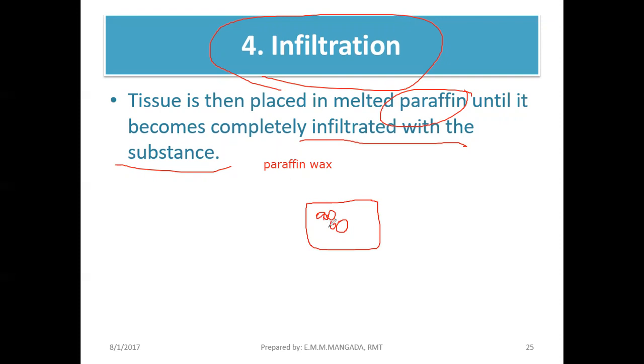So guys, yung ating paraffin infiltration or impregnation, we usually use naman 2 to 3 changes of paraffin wax. So, nilulublob natin or binababad natin yung ating tissue for hours, doon sa ating beaker or container that contains melted paraffin. So, what do you think is the principle behind the infiltration and impregnation? Something like this.